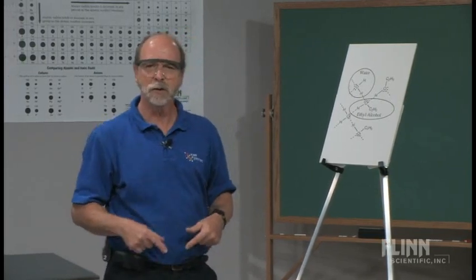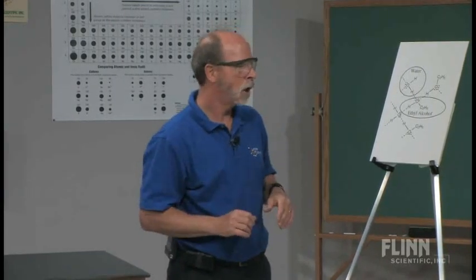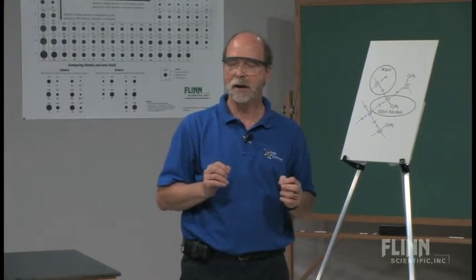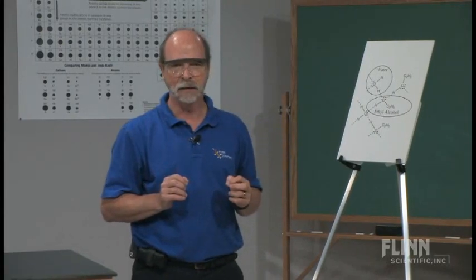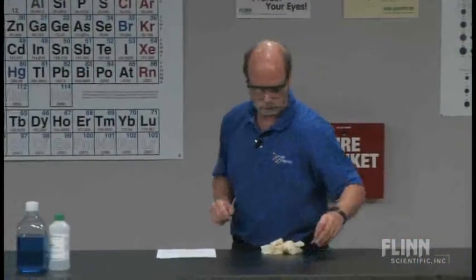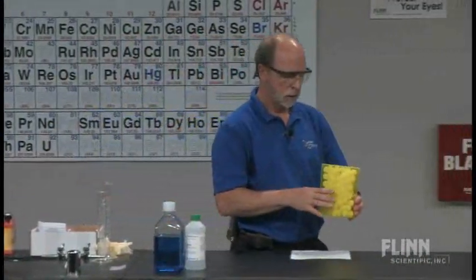Now that's difficult to see for students. It's difficult for me to envision that. So I have another demonstration illustrating how we can show that volumes are not necessarily additive. And this is one that we can see. So we're going to go back to the table. For this, we don't need the gloves, so I'll put those aside. We're going to take a look at solid state.